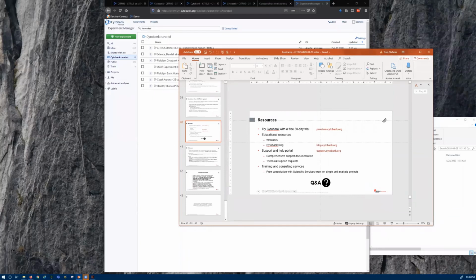Okay, perfect. So what is the difference between Citrus and doing a non-parametric test on FlowSOM metaclusters, in the case of two groups, healthy and diseased, such that you look at the metaclusters, and the difference between the two groups is significant between the two conditions?